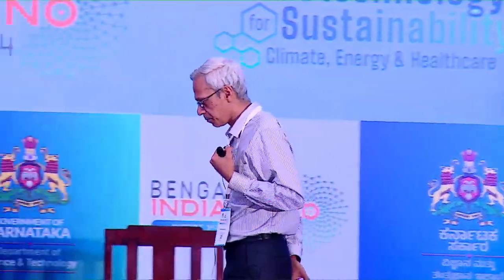And the third and biggest problem is that high energy electrons will damage your specimen. There's no getting away from that. Any specimen will get damaged by the electron beam. Doesn't matter what specimen, right? If you keep the electron beam long enough on the specimen, it will get damaged. Biological specimens, polymers and other things will get damaged much faster. All other inorganic specimens also will get damaged. So it's very important, right?